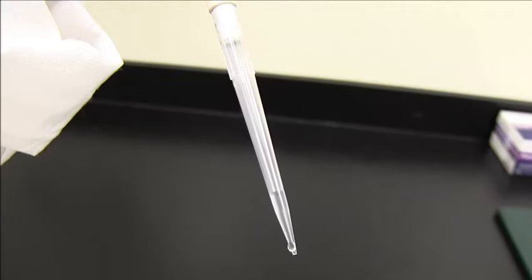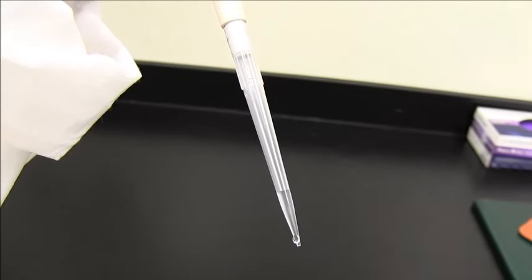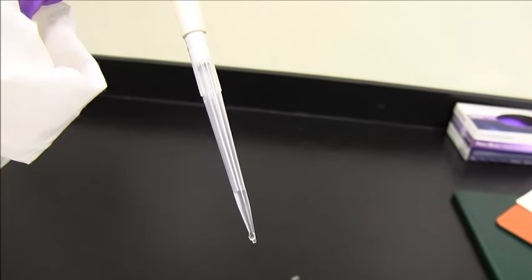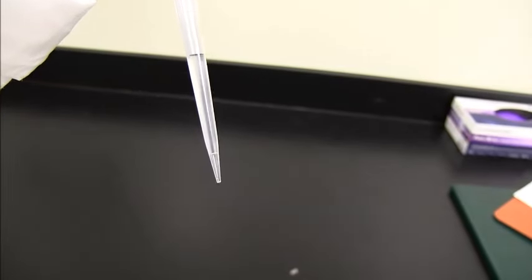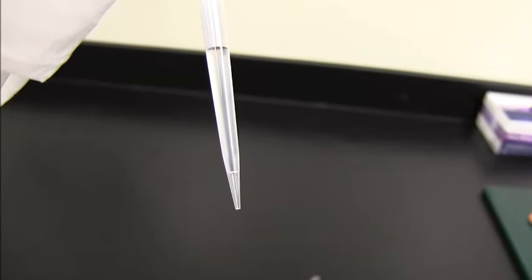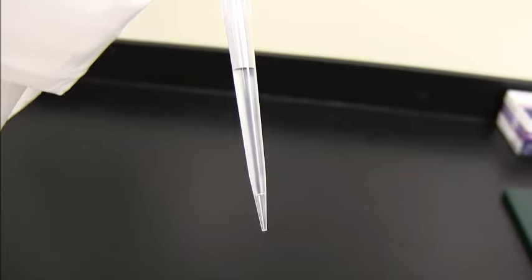When you're getting your volume, sometimes some water can be stuck to the outside of the pipetter. And this can actually throw off our reading. So when this happens, all we do is we take a chem wipe and wipe the tip off. And now we're good to go. Also, sometimes when you're getting the volume, you'll see a little bubble in the tip. You see how the water doesn't go all the way down to the tip. And this is going to also throw off your volume. So when this happens, we just need to take all the water out of the pipette tip and start over again.